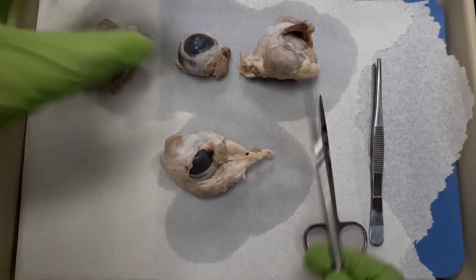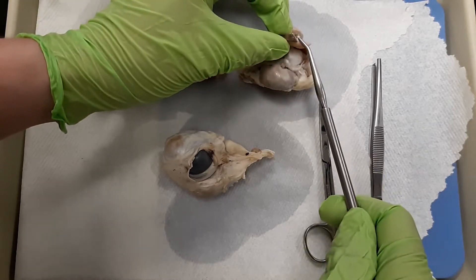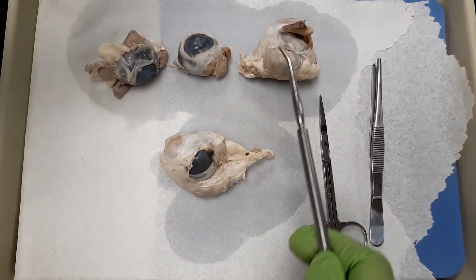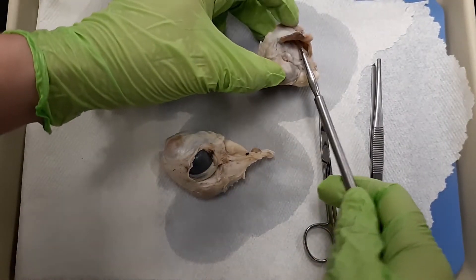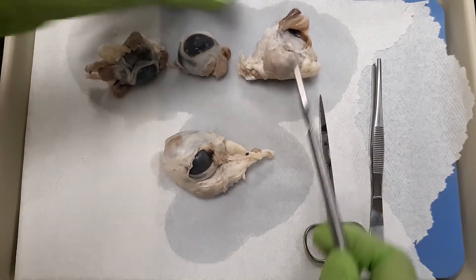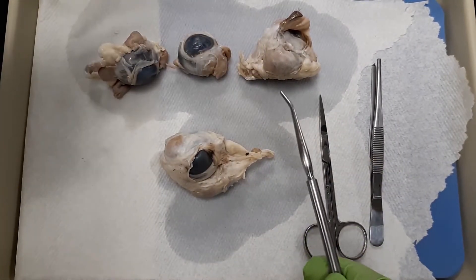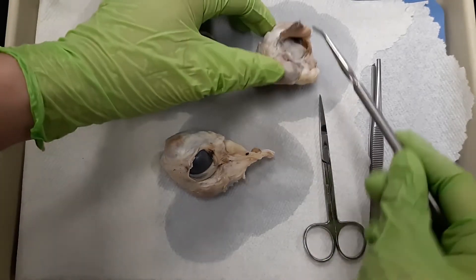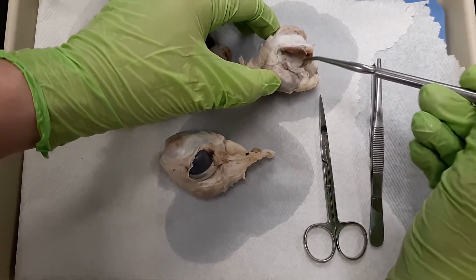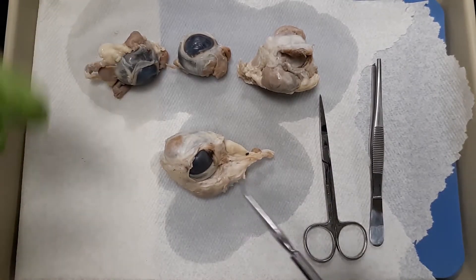If you don't have a nice clean eyeball, you're going to note that you have a bit of eyelid and sometimes you can see the little hairs — those are going to be eyelashes. Remember this was a living thing, so let's appreciate its donation to us. On the inside of the eyelid is where we have the conjunctiva — that's the pink inner surface of your own eyelid. You have a superior and inferior lid, upper and lower, and those conjunctiva each have their own name, but we're going to focus on the internal eye structures.